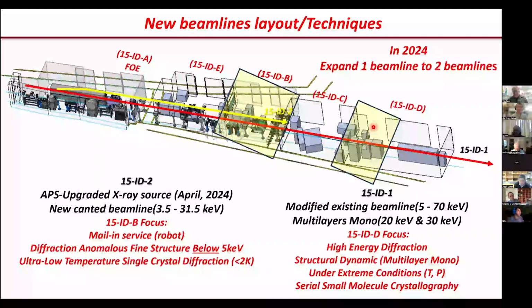For both hutches, we set up the power and everything. The cylinder is already set up, so we only need to transfer the compressor. We want to sit it in one hutch, but if you need it, we'll try to make it portable so it can go to another hutch.